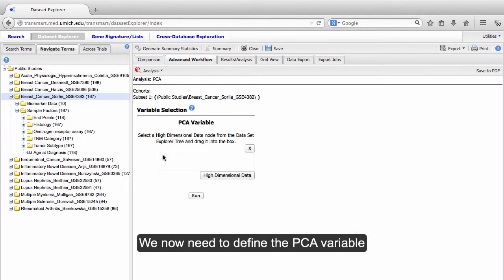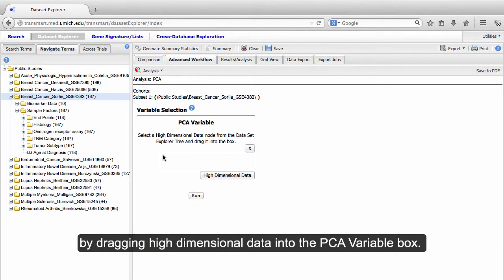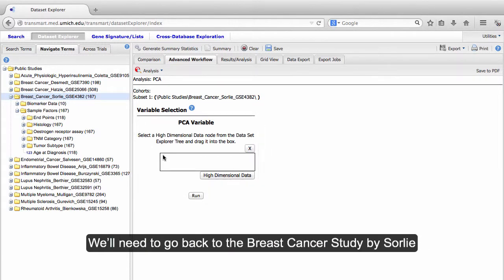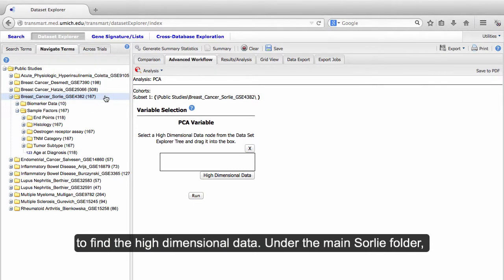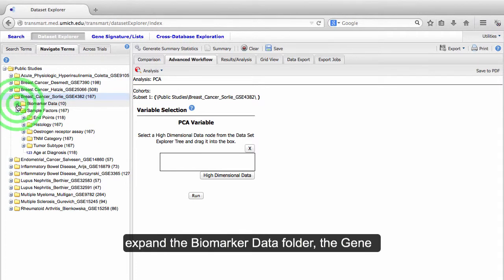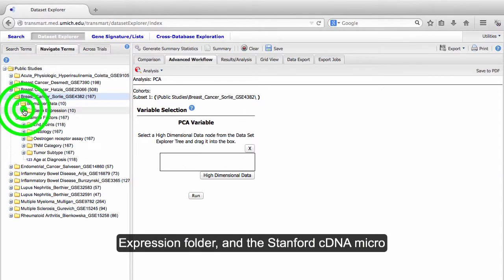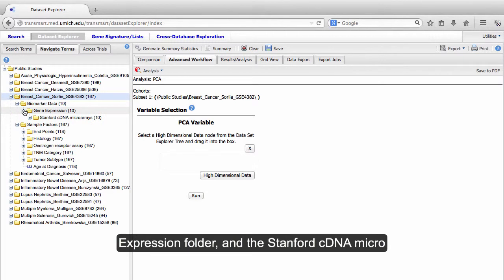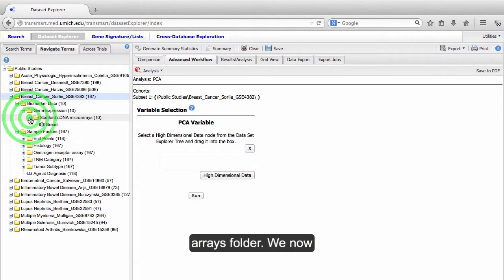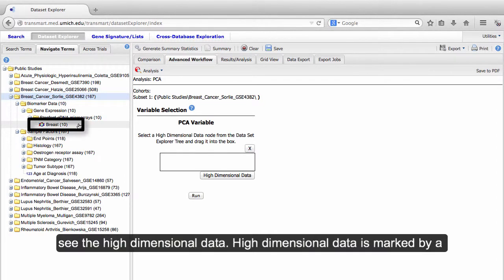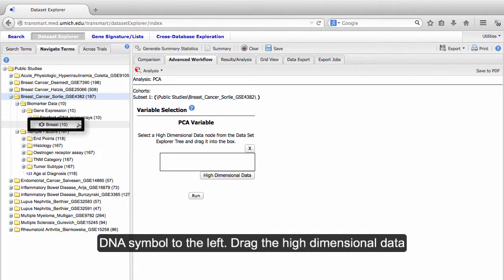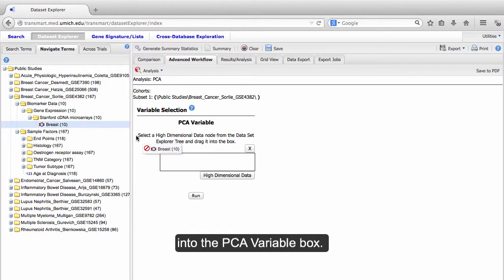We now need to define the PCA variable by dragging high-dimensional data into the PCA variable box. We'll need to go back to the Breast Cancer Study by Sorlie to find the high-dimensional data. Under the main Sorlie folder, I expand the Biomarker Data folder, the Gene Expression folder, and the Stanford cDNA Microarrays folder. We now see the high-dimensional data. High-dimensional data is marked by a DNA symbol to the left.